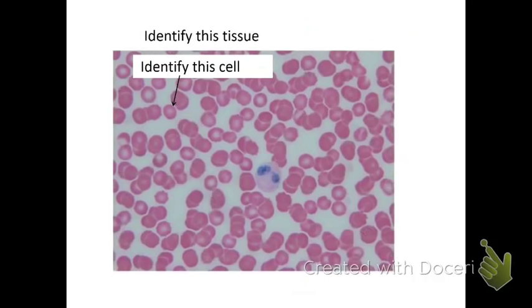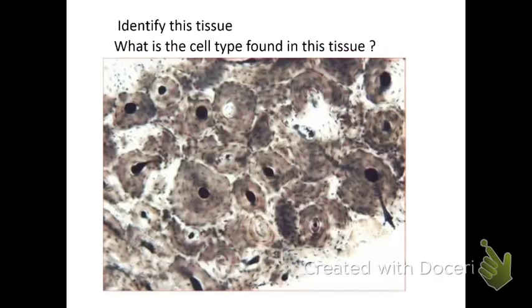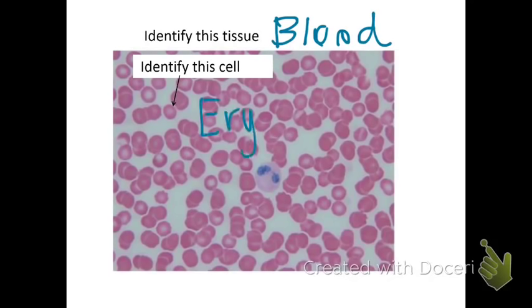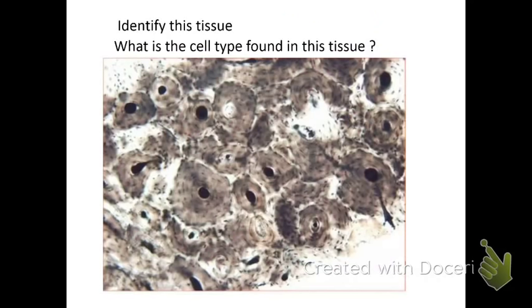Take a second and try to answer that. This is blood. It's a connective tissue, and the cell is an erythrocyte, or a red blood cell. We'll write erythrocyte. Make sure you know how to spell erythrocyte. Go over that one.